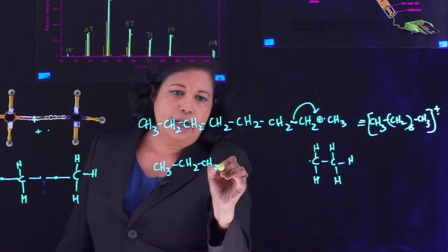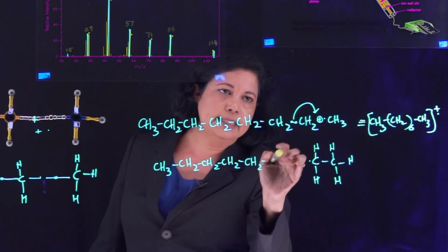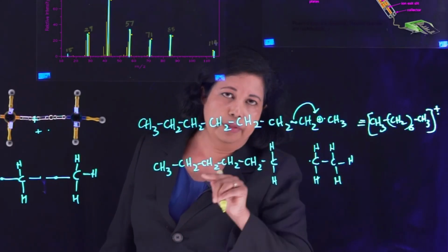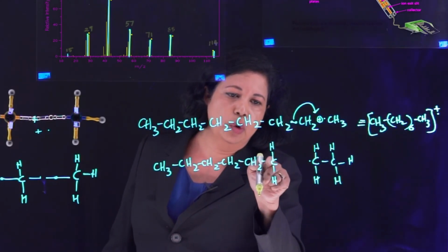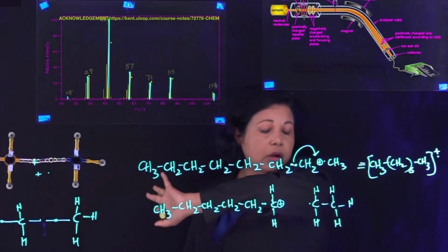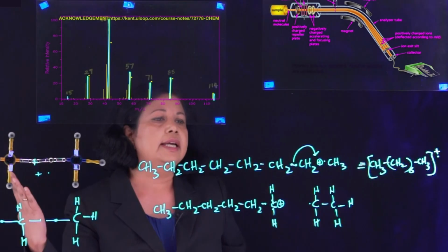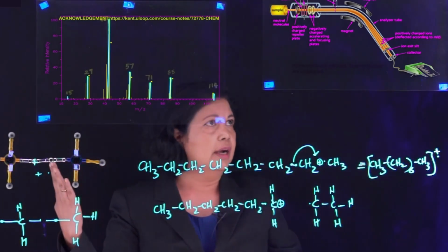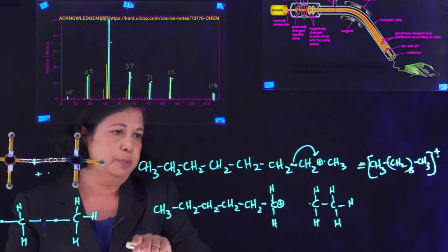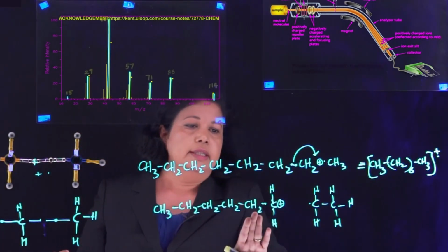All right. So here is your fragment that's coming out. 1, 2, 3, 4, 5, and 6. This guy has got a big hole, nothing here. So the formal charge here is 4 minus 1, 2, 3, which is a plus. The plus goes all the way, bam, hits the detector, and the guy there on the detector says, all right, welcome to the junkyard. We got more of you here, and you can pile up with your kind. So it puts them in the same place. As more and more of these come in, you're going to see this piling up.